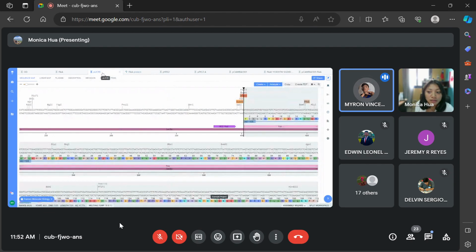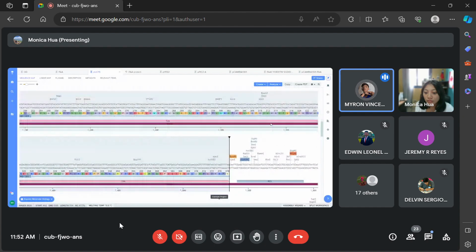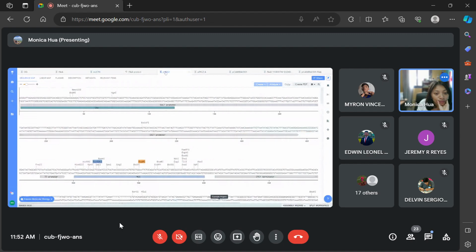Can you repeat that one more time, please? The part where you copy and paste it, and then you went a little too fast. You mean copy the entire sequence? Yeah. Okay, we could copy the sequence.